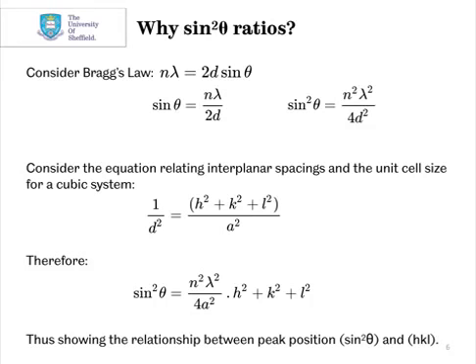We can also consider the equation that correlates the d-spacings between planes in a lattice and the unit cell size for a cubic system: 1/d² = (h² + k² + l²)/a². Combining these 2 equations gives us sin²θ = (n²λ²/4a²)(h² + k² + l²). This nλ section effectively becomes a constant, and so we can ignore that for the time being. So what you can see is there's a direct correlation between the position of the peaks in sin²θ and the Miller indices h, k, l.